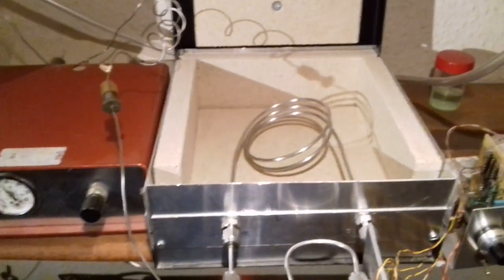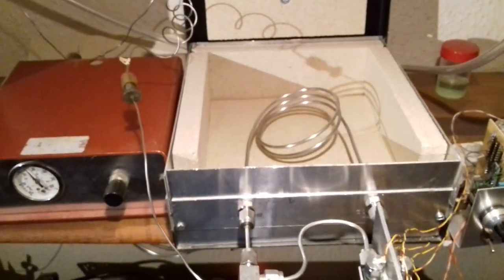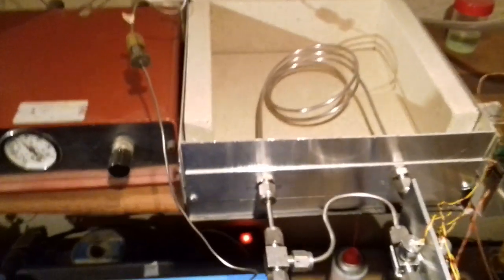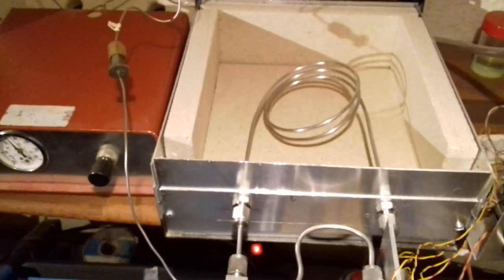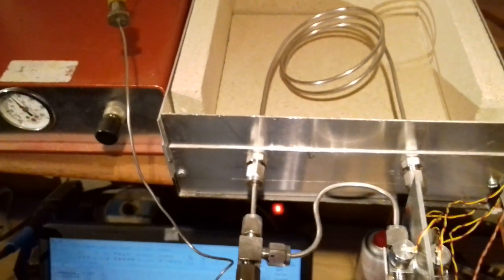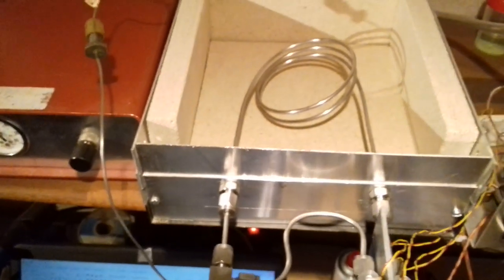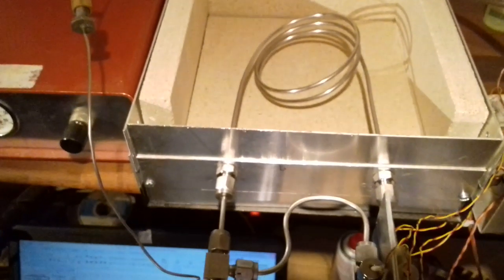There are, of course, many things that could be optimized. Most people who've used a gas chromatograph will notice that it's not heated. That's pretty much a non-starter for 99.9% of the compounds you want to run gas chromatography on.